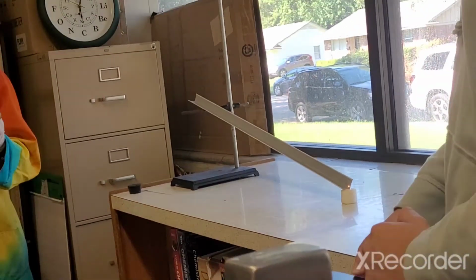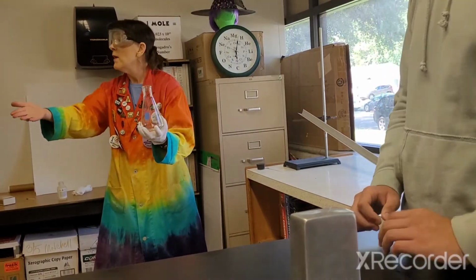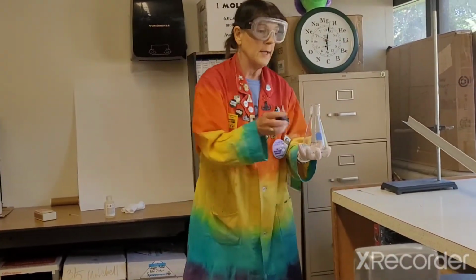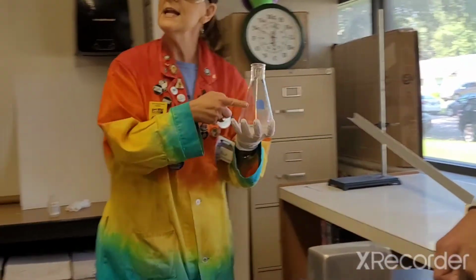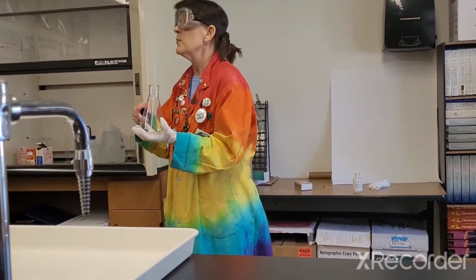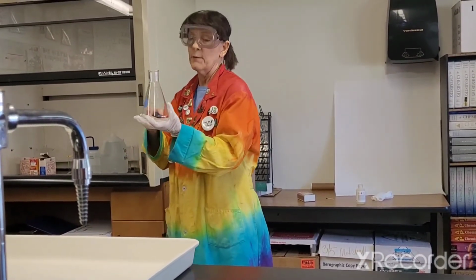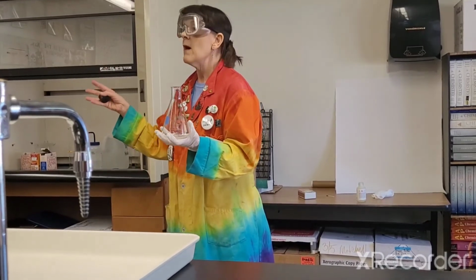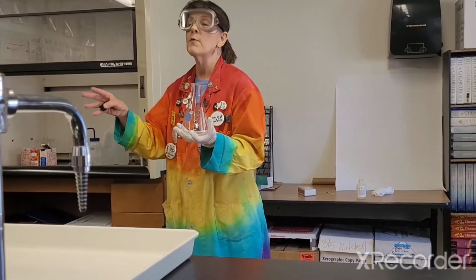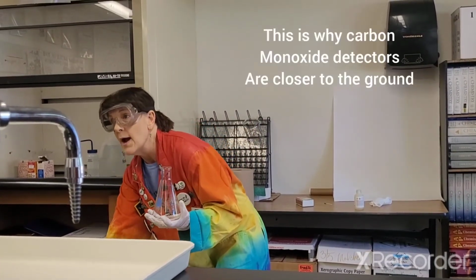All right, so ladies and gentlemen, did y'all ever see anything go down that ramp? No, you couldn't see it, could you? And yet, just that fast, ladies and gentlemen, anytime that we are working with a flammable vapor, we have to be super, super careful with the surroundings. One of the things it says when we talk about this demo is, think about if you were in your house and there's a flammable vapor in your house. It's going to sink to the floor. It's going to go down, right?